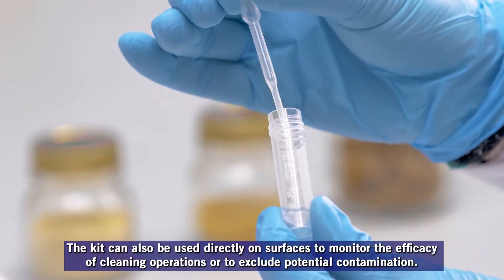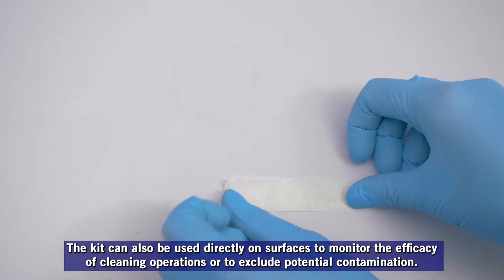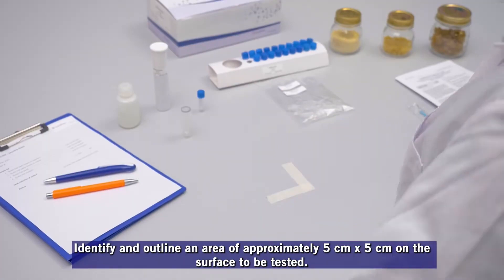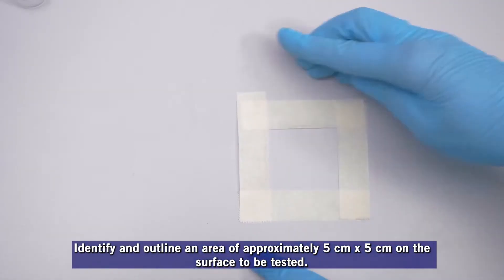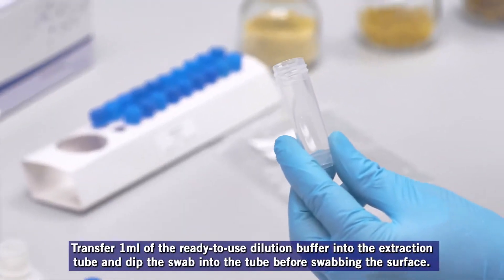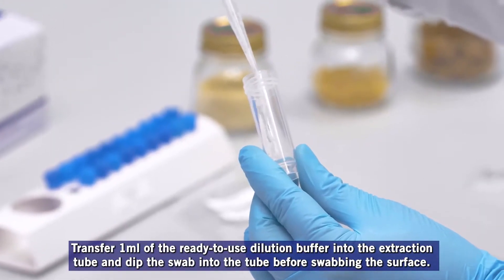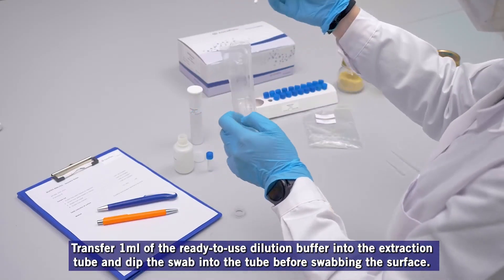The kit can also be used directly on surfaces to monitor the efficacy of cleaning operations, or to exclude potential contamination. Identify and outline an area of approximately 5 centimeters by 5 centimeters on the surface to be tested. Transfer 1 milliliter of the ready-to-use dilution buffer into the extraction tube, and dip the swab into the tube before swabbing the surface.